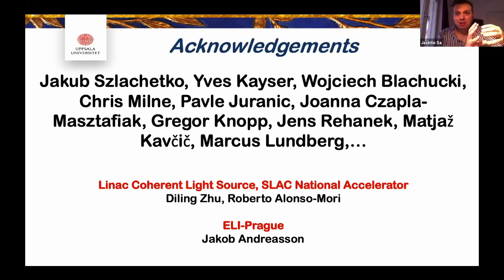But the other important thing is that it seems, at the beginning, that the electronic structure of the metal is quite crucial. So for example, for gold, it follows the electronic structure very well: how you occupy these empty states. But on silver, this is maybe not true. And silver in this case is actually the holy grail, not because it's cheaper, but because silver has a much better plasmonic response. So for example, the solar cell company that I have uses silver, and the efficiencies are significantly higher compared with gold. So all of this is unknown. This has been simulated.